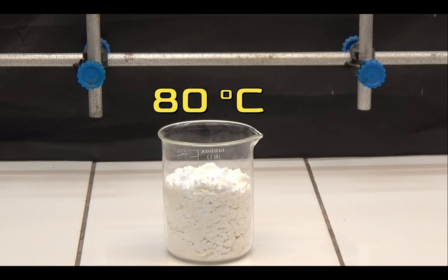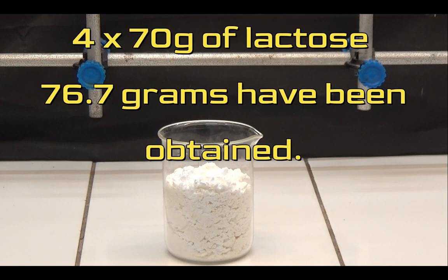The solid obtained is dried at 80 degrees in an oven and then weighed. I carried out 4 equal operations with 70g of lactose each, and a total of 76.7g have been obtained.